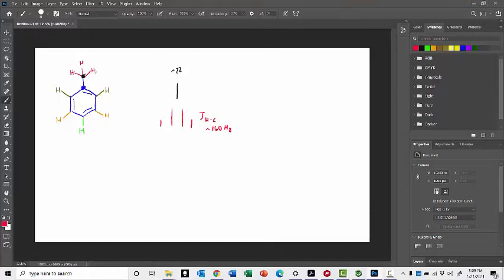So where do we have hydrogen atoms further away that can reach? The answer is these brownish, yellowish ones out here. These 2 guys, since there are 2 of them, are the ones that would convert this black dot into a triplet.